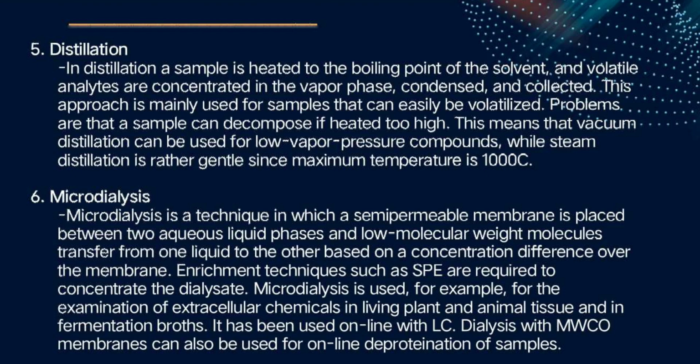Microdialysis is a technique in which a semi-permeable membrane is placed between two aqueous liquid phases and low molecular weight molecules are transferred from one liquid to the other based on a concentration difference over the membrane. Enrichment techniques such as solid phase extraction are required to concentrate the dialysate.